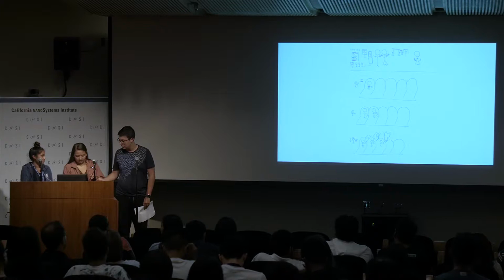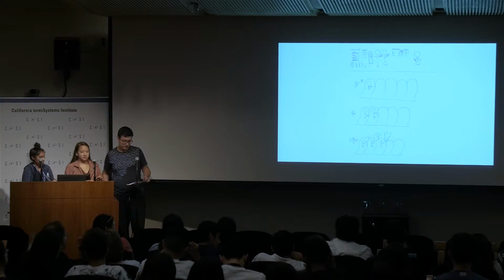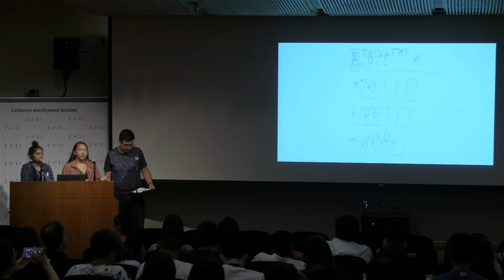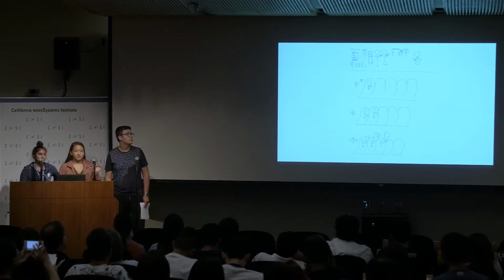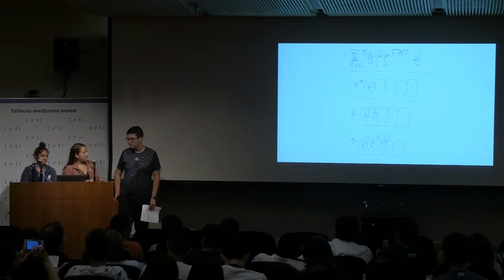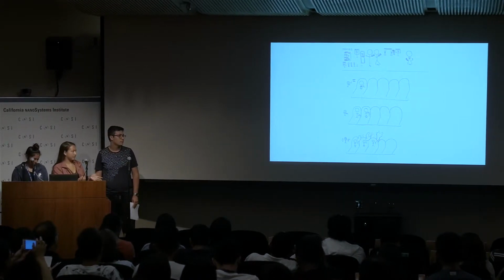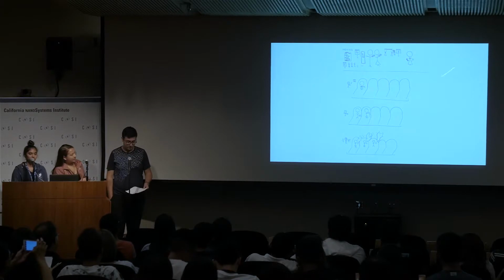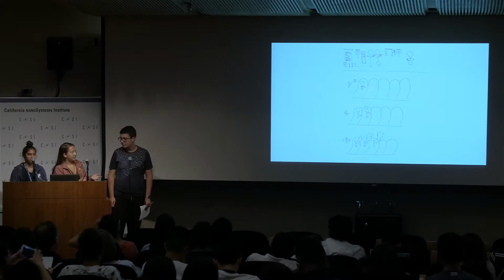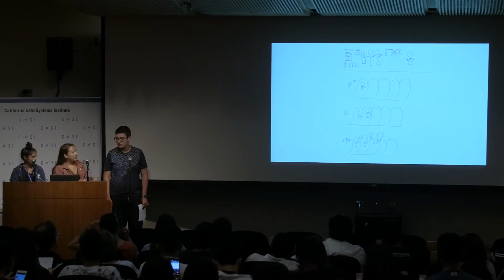Another important concept was that different sizes of silver can have different levels of toxicity on cells. The silver nanoparticles had the greatest toxic effect on the yeast cells because they're the smallest. The yeast cells mistook them for food and took them in through endocytosis. That relates to the picture because on the bottom you have the small children, the smallest people here, and they make the biggest mess. Then the adults make a slightly smaller mess, and the fancy cocktail lady makes a small mess. That relates to the nanoparticles versus the ions versus the powder in the experiment.